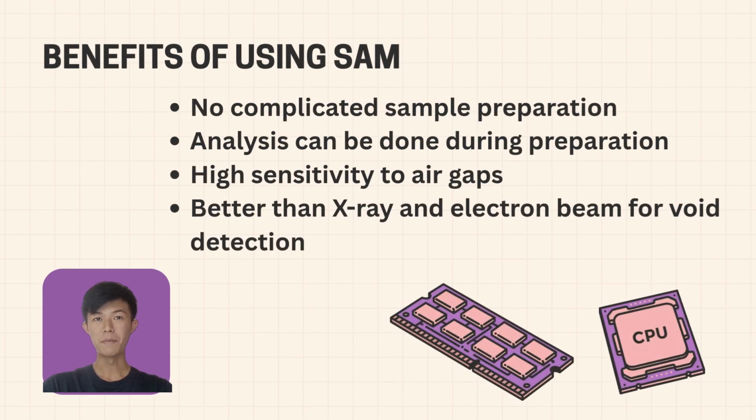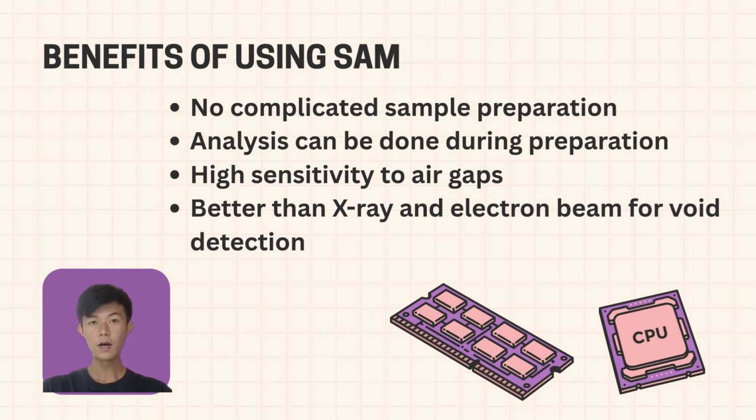One major benefit is that it saves time. Unlike SEM or TEM, it does not require complicated sample preparation. More importantly, SAM is extremely sensitive to air gaps, even at submicron thickness, where X-ray and electron beam techniques may fail because they can pass through voids without strong contrast.